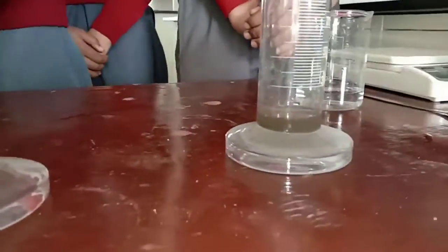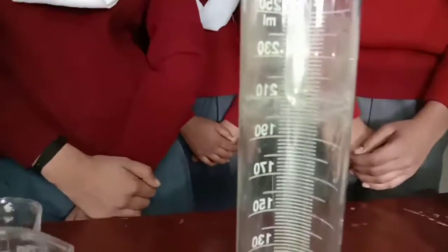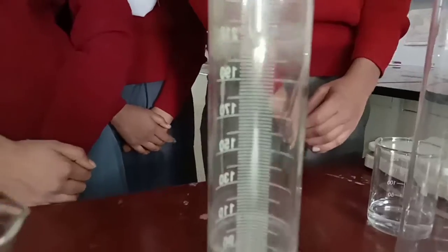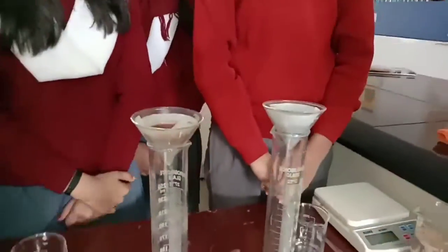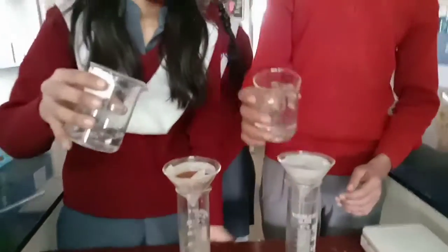We'll wait for some time for the water to come down drop by drop here. After that, again we will pour some water onto it. Again we'll wait for a while, and we'll repeat this process.